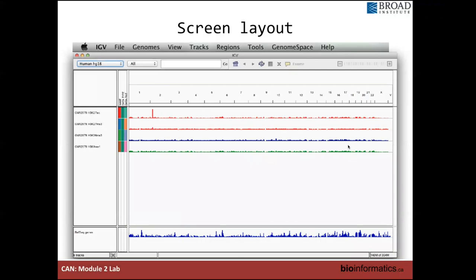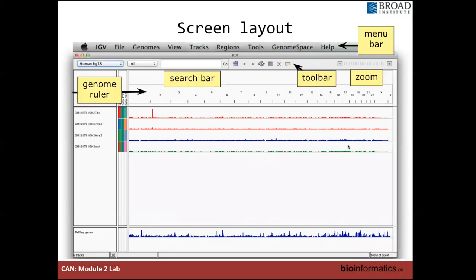This is an example of some methylation data, I believe. And here is a breakdown of what everything is. So at the top, you have your menu bar, like you do with pretty much any app. The toolbar along here, this is where you load the reference genome. There are buttons to zoom in and out of the different genomic regions. The search bar allows you to type in genomic coordinates to quickly navigate to regions of interest. And there's this genome ruler underneath, which indicates which region of the genome you are currently viewing. So when you first start, it'll give you an overview of all of the chromosomes. When you actually view into a specific region, you'll get an ideogram of a specific chromosome.